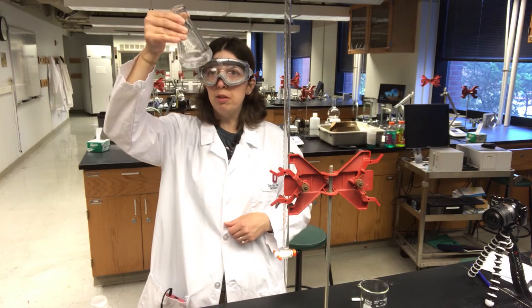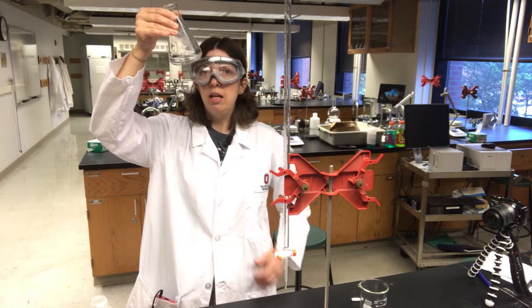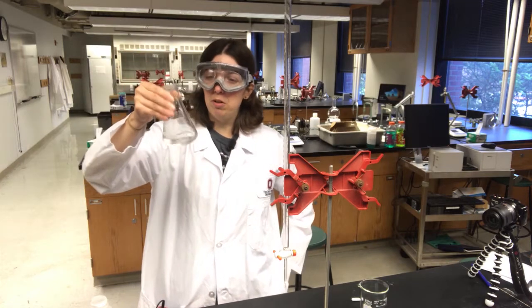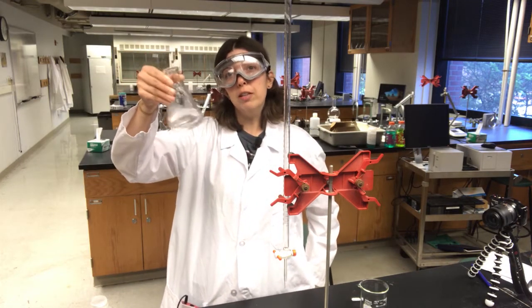Occasionally I'm going to stop swirling and look at the bottom of the flask to see how much solid is left. I can still see that there are a couple particles in there, so I'm going to keep swirling until I completely dissolve all of the KHP.